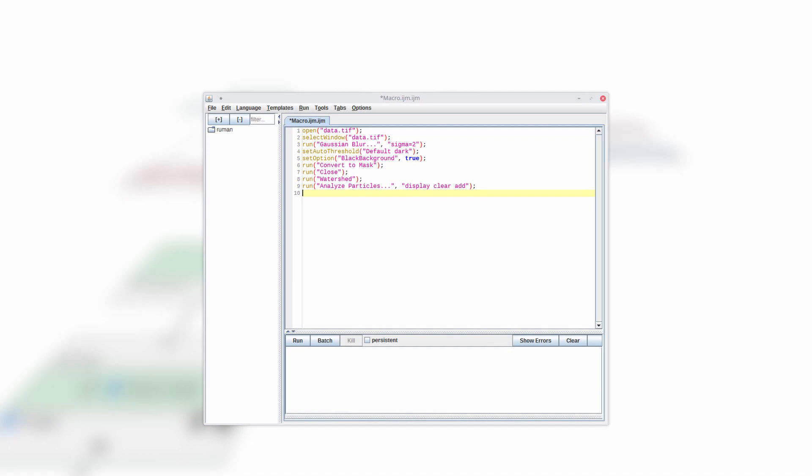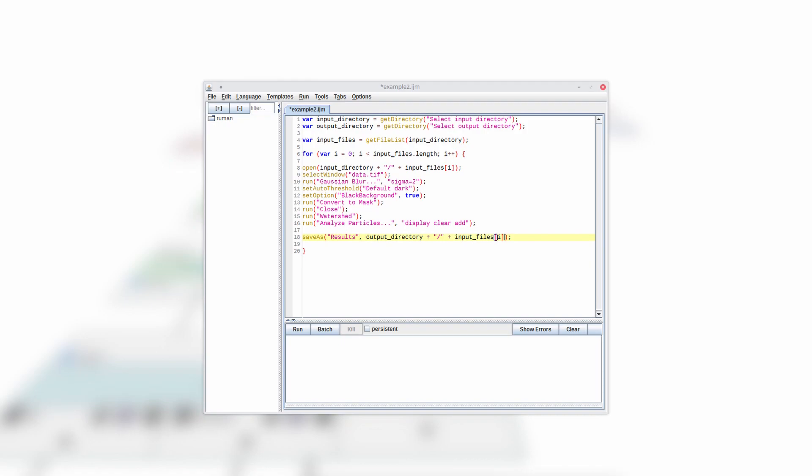However, there is one catch here, namely that transforming such an analysis into an automated workflow then requires experience in a macro programming language. And lots of additional work will be involved in detecting the file inputs, as well as keeping track of the data during the whole analysis and, of course, writing the results.